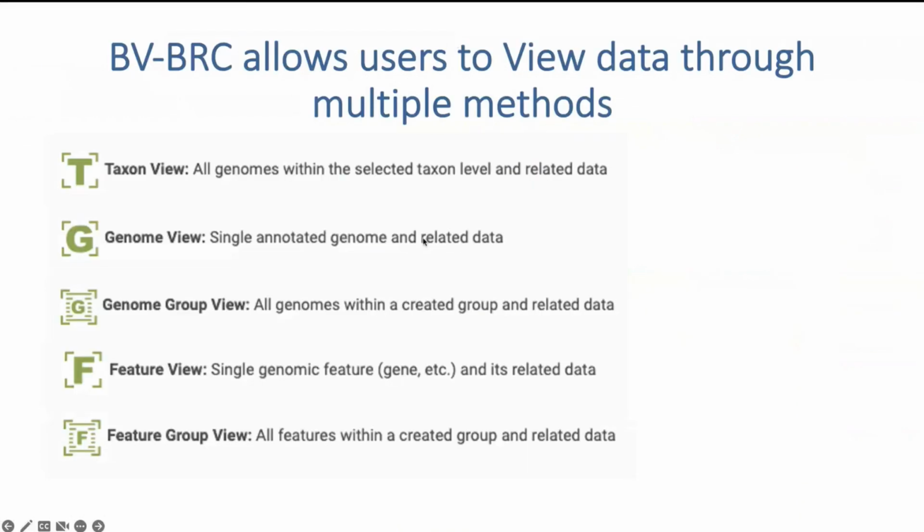So today I'll be going through a few different things, especially nomenclature and structure of the website, because especially if you're coming from IRD, the interface is going to be a little bit different from what you're used to. So understanding how the data is presented, what the different views are, and what the different wording and nomenclature is for different things is important.